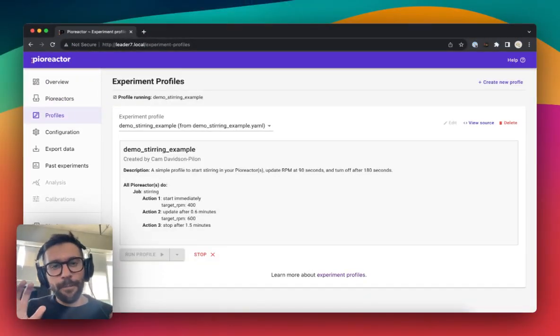I feel like people SSHing in is an anti-pattern that we should avoid as much as possible. The browser's awesome, UIs are great. Let's do as much as we can in the browser where people are comfortable, rather than in a terminal working with exotic bash commands.